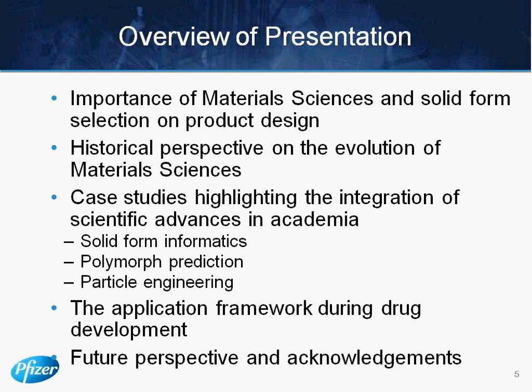So in the presentation, what I'm going to do is describe the importance of material sciences and solid form selection on product design, give a personal perspective on the evolution of material sciences over the last 15 years, and highlight some scientific advances in academia around solid form informatics, polymorph prediction and particle engineering, and describe those in the context of trying to design a commercial solid form for robust product design. We're going to talk a little bit about how these can be applied during drug development, future perspective and acknowledgement.